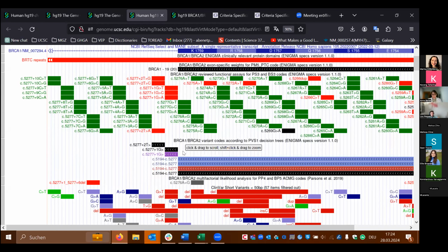And this is the ClinVar variants. We have the HGMD and the LOVD. We have also added the BRCA Exchange Hub that Melissa Cline, I think she's here in the call, also designed together with Max Haeussler some time ago.